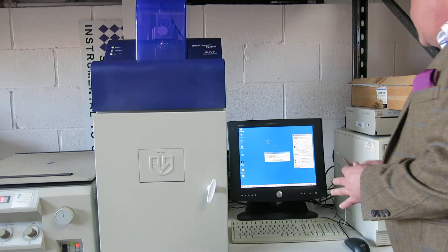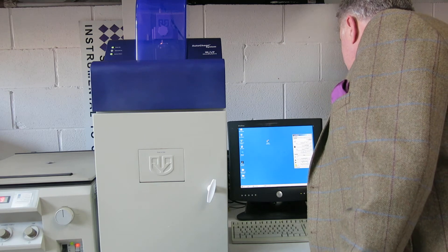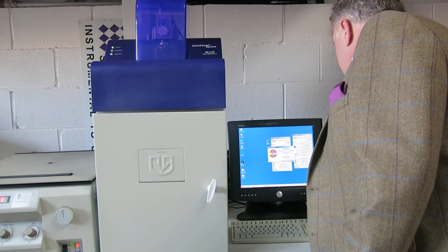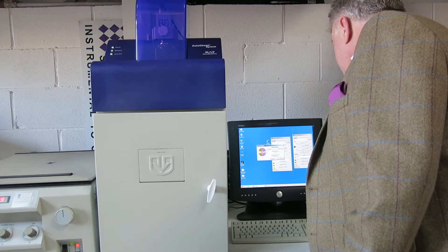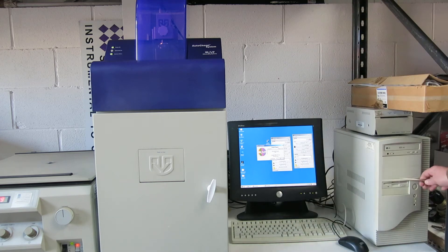We've got the computer which has got the AutoChemi software on it. This is AutoChemi version 1.0.21, made by UVP. We've now got the PC.